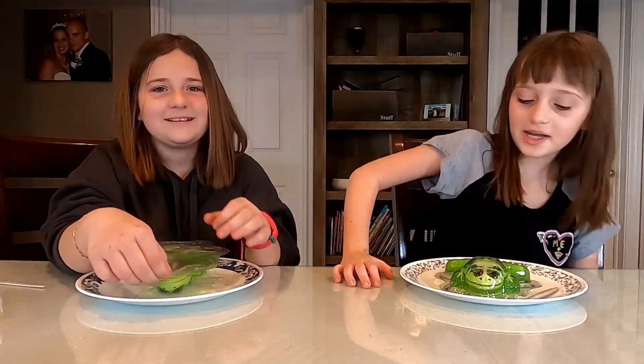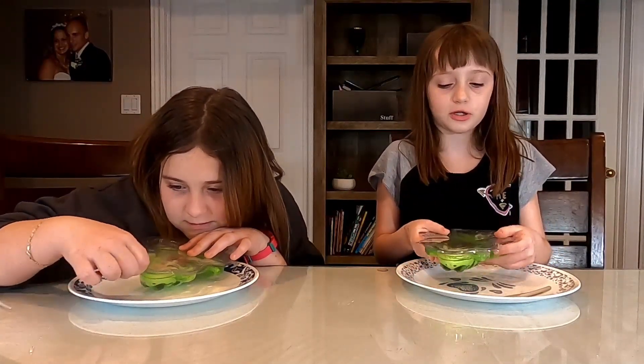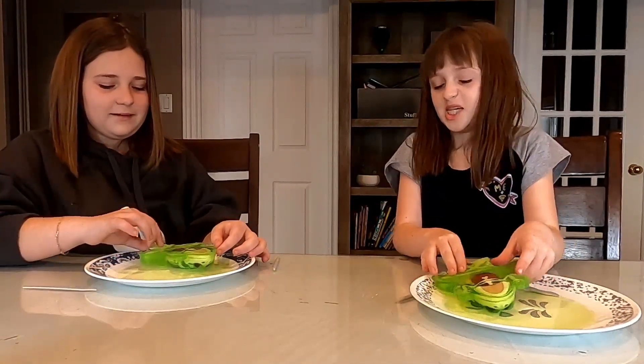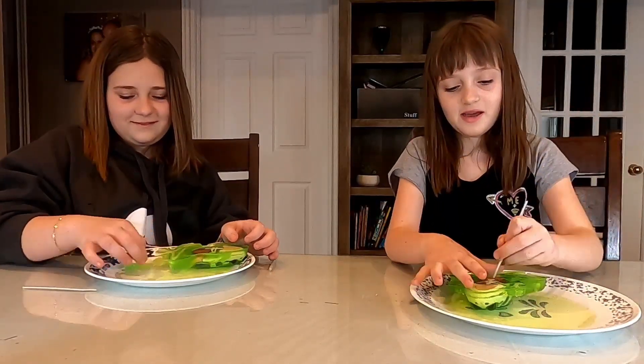I'm so nervous. Okay so we're going to cut this belly open and while we do that we're going to talk about the body parts and what they do. So let's get cutting with our utensils. Ew, it's all slimy. My foot fell off. That's alright, it's helping you dissect it a little faster.